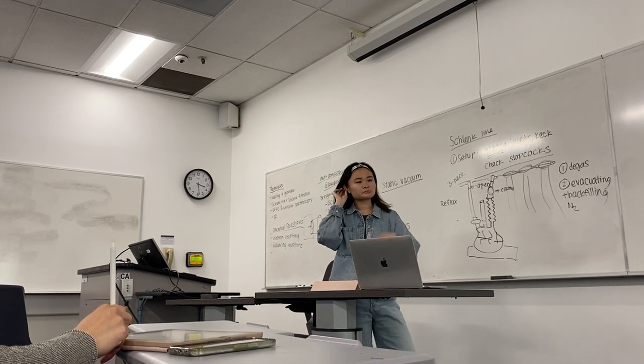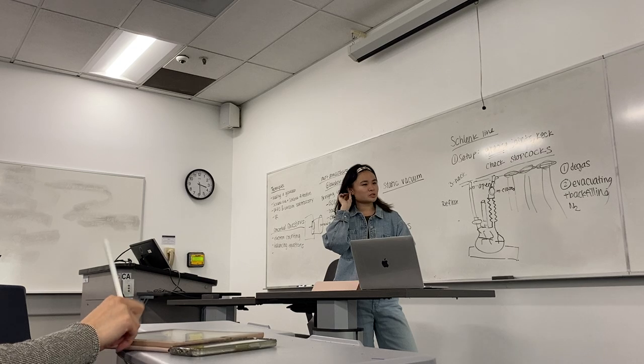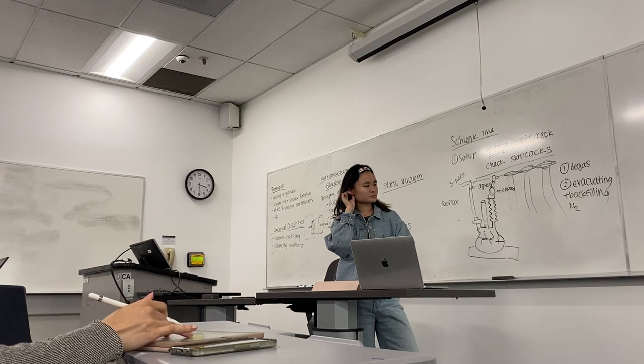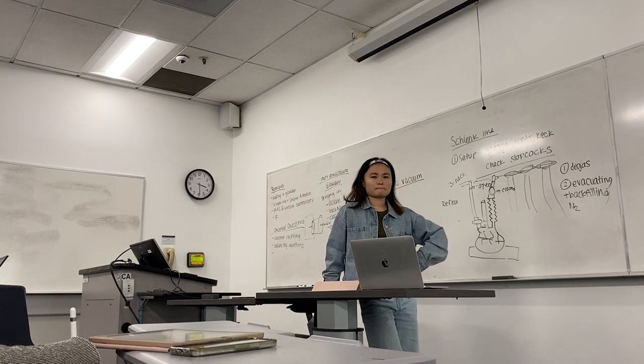No, not really. Okay. So when you're degassing, do you put the inlet needle into the headspace first, then add the outlet needle, then put the inlet needle into the solution? Is there a specific order for that? I always put it into the solution and then the outlet needle. Yeah, pretty much. I was telling my students it's good practice to put your inlet needle into the headspace first before putting it straight into the solution. But as far as the order of operations, as long as you have a positive flow the whole time.